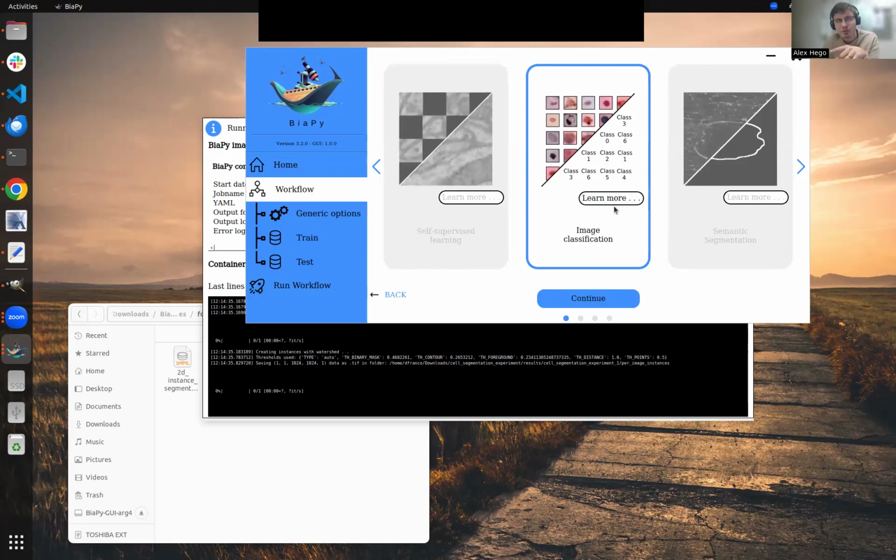But if I do the classification workflow, it will be done on the mask? No, you can crop a region of the raw image, not the label. With the label, you have already segmented the cell, so you know the position to make the crop, and then use the classification. Yeah, this is actually on our to-do list, because since we are incorporating all the models from Torch Vision, some of those models do exactly as you say. Thank you very much.